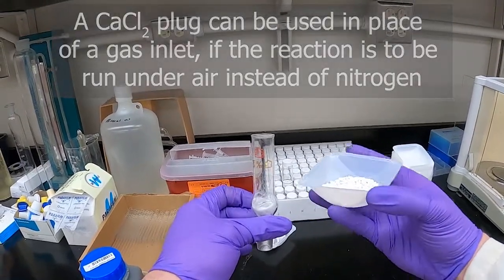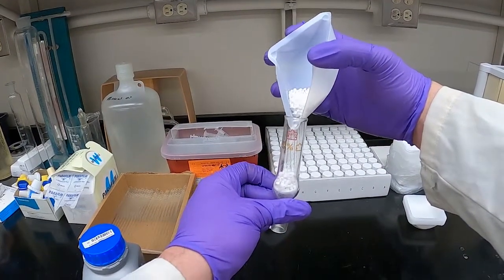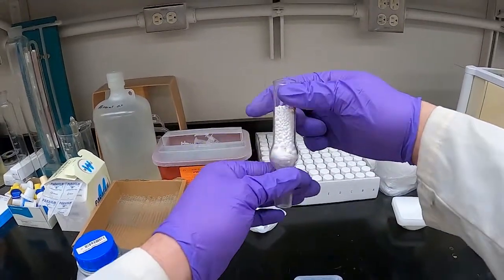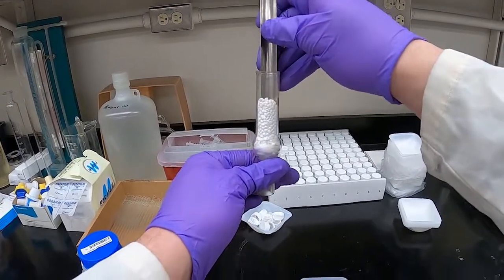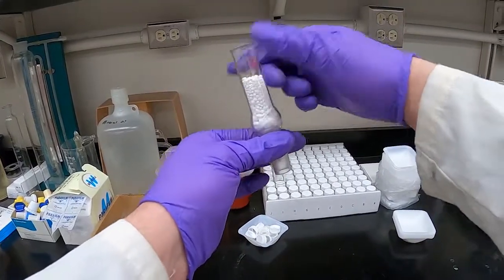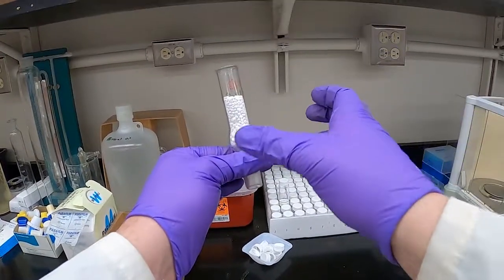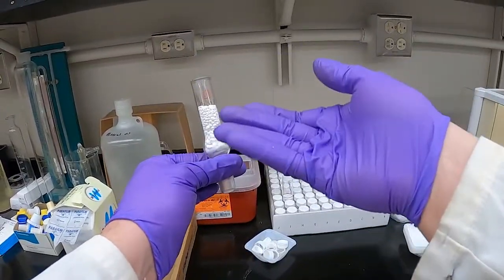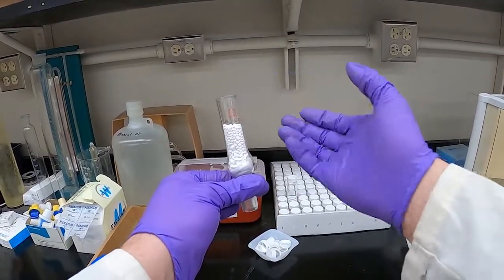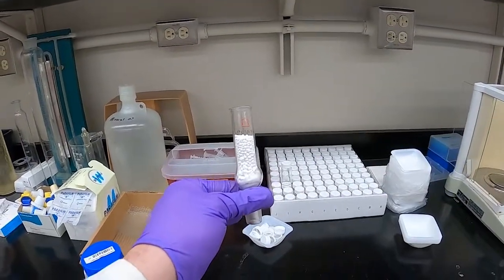So we'll take our piece of glassware here and just pour in these calcium chloride pellets. And that should be enough. Then we'll take our spatula and tamp them down a little bit. In this case, since this one will sit vertical or nearly vertical, we don't need to put anything else in the top of it. There are other types that have kind of a bell shape, and you'll need to put either more glass wool to pack it to retain the calcium chloride, of course, so it doesn't fall out, or rubber stoppers with a hole in them work as well. That's also done.